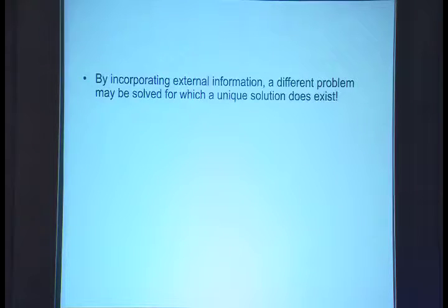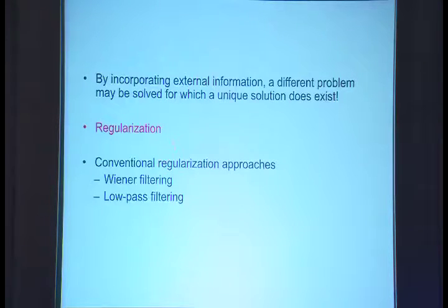So what can we do about it? The way we can do it is to use something which we know as a prior to solve this problem, which is called regularization. This is very common, what we call low-pass filtering or Wiener filtering.